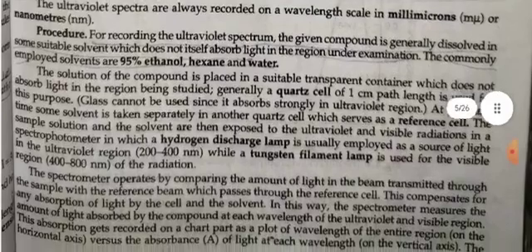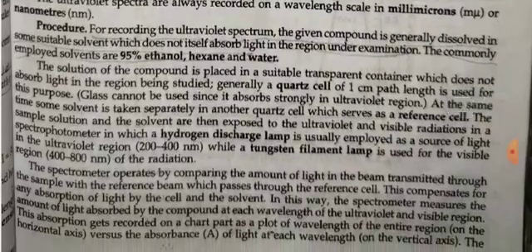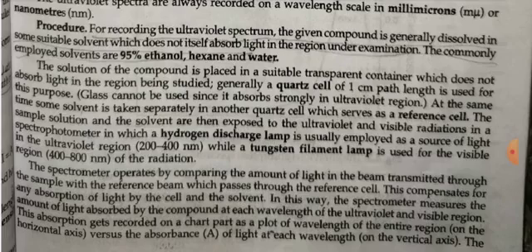Procedure for recording the ultraviolet spectrum: the given compound is generally dissolved in some suitable solvent which does not itself absorb light in the region under examination. The commonly employed solvents are 95% ethanol, hexane, and water.